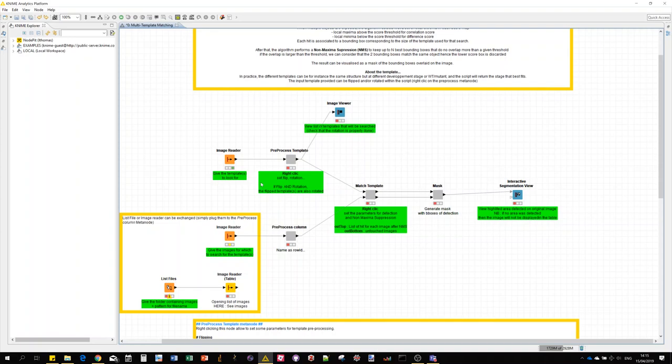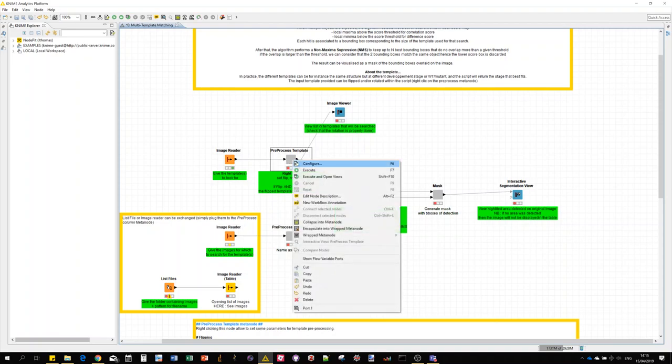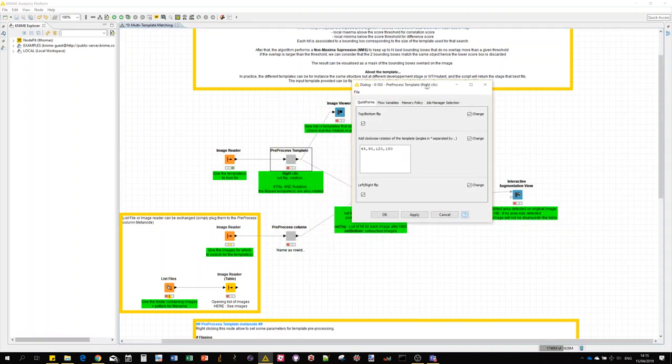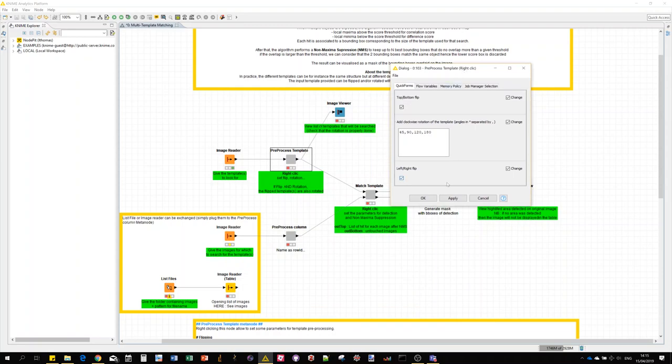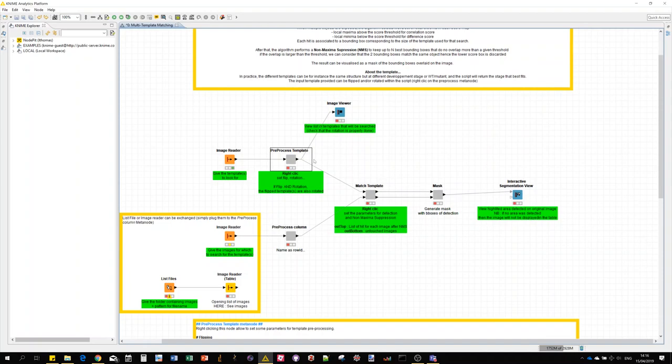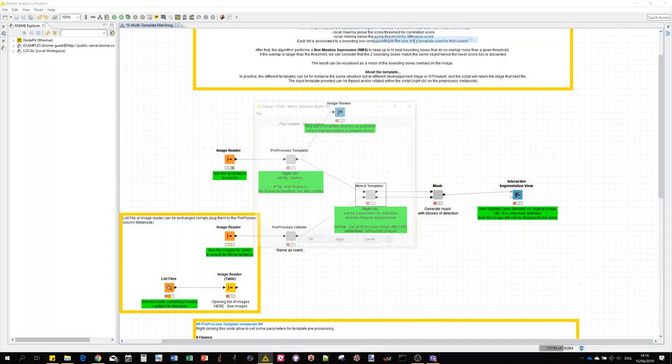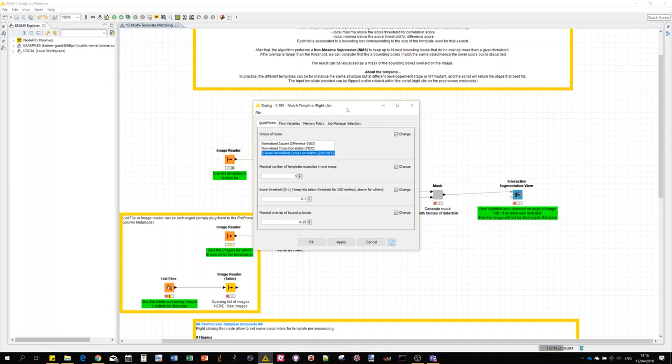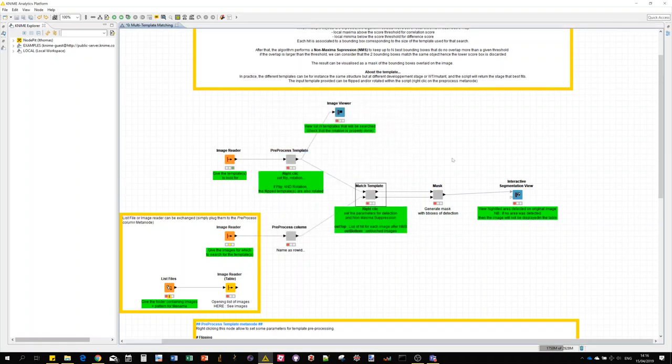All kind of interaction points are highlighted in green: either the image input here, also those two are kind of interactive meta nodes. Here we can set parameters for the template preprocessing, so flipping and rotation. Basically the initial list of templates that you select will be rotated and flipped to generate additional templates for the search to improve the probability to find the objects. Just keep in mind that the more templates or the more transformations, the longer the computation. Also for the match template we have a couple of parameters: choice of the score, expected number of objects in each image, score threshold and maximum overlap between detections.